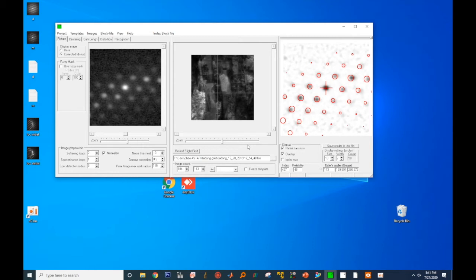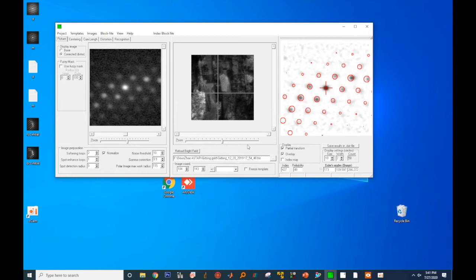To further improve the match, we need to fine-tune the camera length. I will add one more note here. When doing the camera length calibration, try to find a pixel that's close to one of the zone axis. In this case, you have many spots to do the matching. Try to avoid the two-beam conditions or some random orientation.